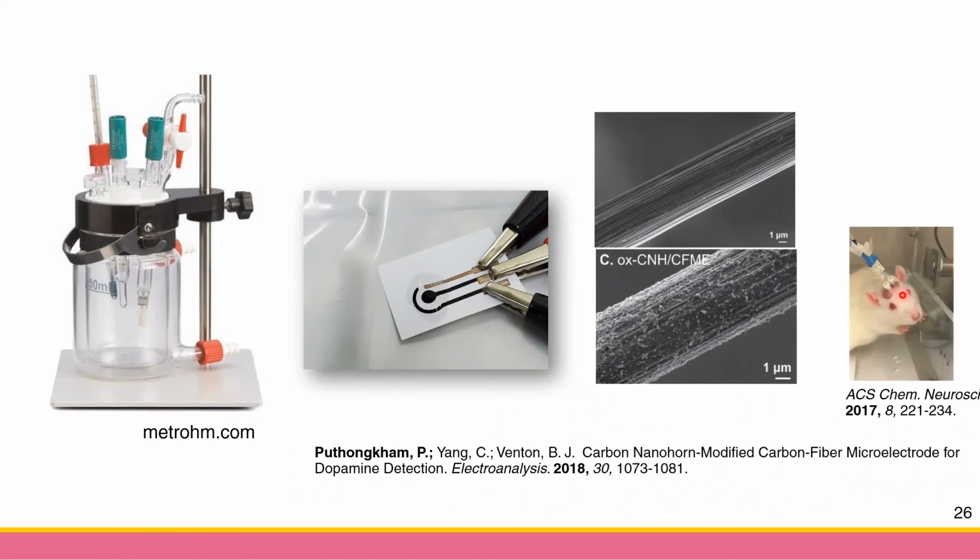And because you can see that the animals is small, so to plug this bulk electrode is too large, right? And then the working area is actually the brain, and brain is small, so that's why you need the small electrode like carbon fiber. And like my previous experience is to modify the carbon fiber to have more surface area so that you can see more electroactive species and get higher current and improve the analytical performance.